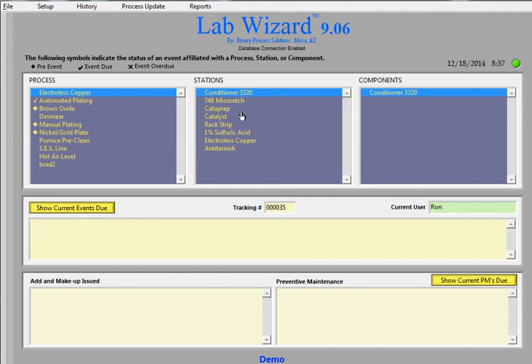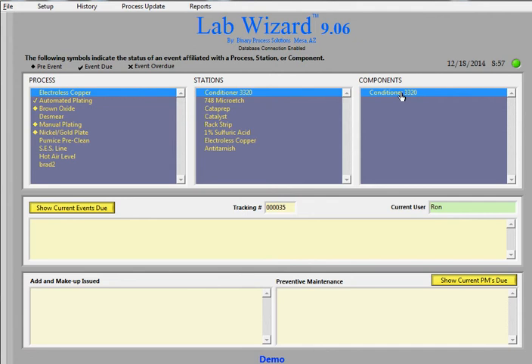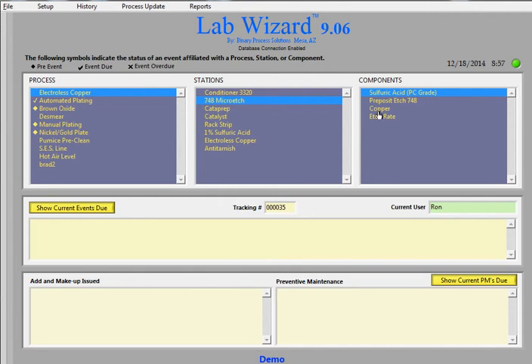And customize the stations, which each tank can be a station, and then the component within that station. So in this case, the electroless copper process has a station called Conditioner 3320. And that's the only component. There's a station called 748 micro etch. And that has four components that can be analyzed.